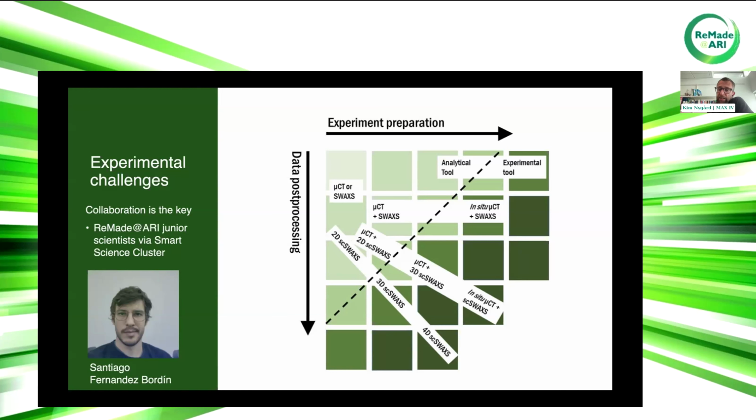So whereas we can still provide SWAXS microscopy as an analytical tool that is fairly straightforward for users to carry out, once you start doing SWAXS tomography or tensor tomography, these are really highly specialized techniques, and they're more of, I would say, expert tools.